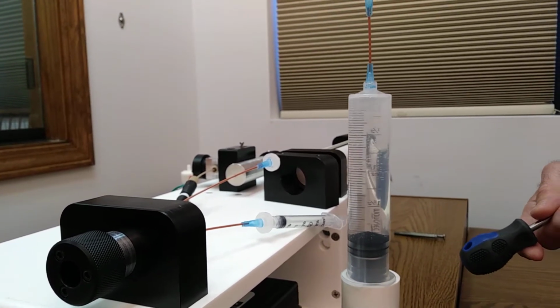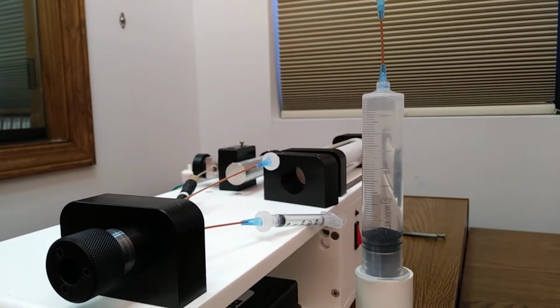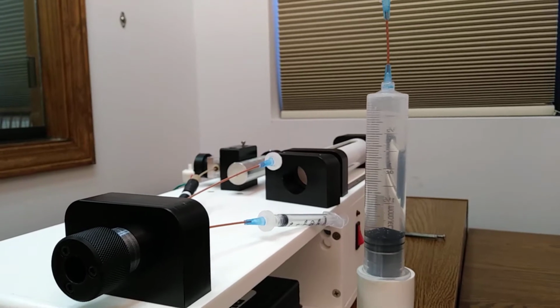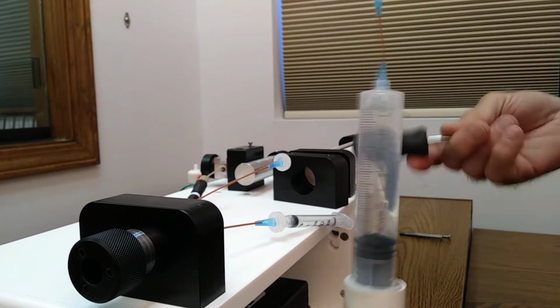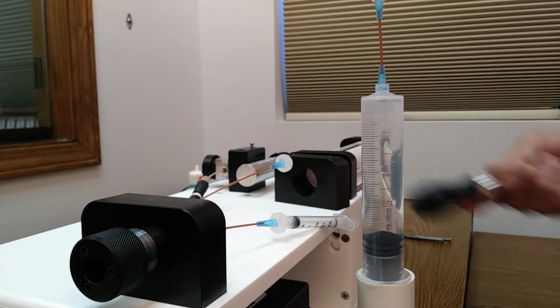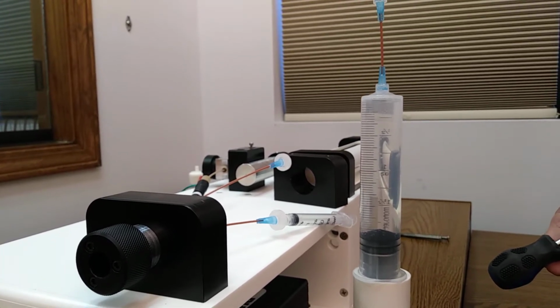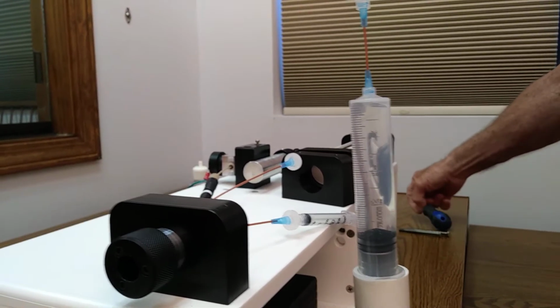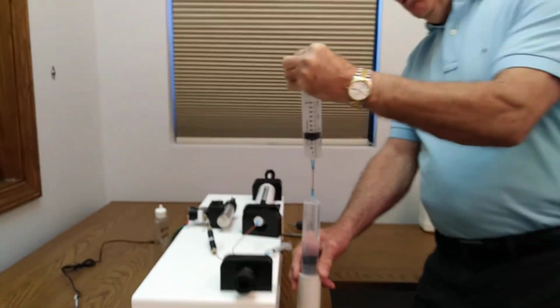And there is no magic point at which you know you have it all out. I just do it like this until it appears that it's evolving more slowly. Okay, I'm going to decree at this point that the air is out. So I'm going to gently release this pressure.